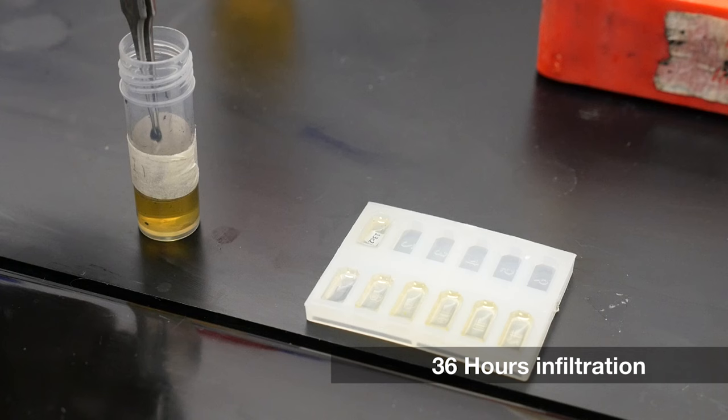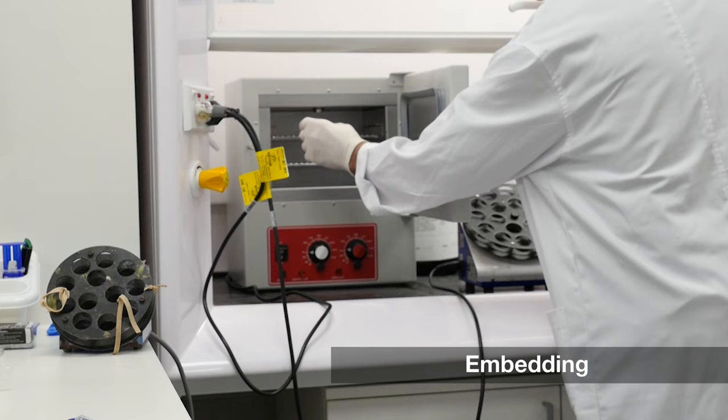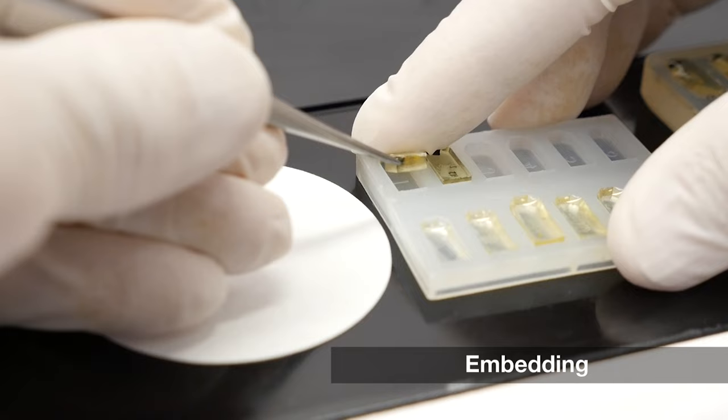Each piece is placed into a small rubber mold, and resin is added. The mold is then placed into a 60 degree oven for two days to harden the resin. The block is now ready for trimming and section cutting.